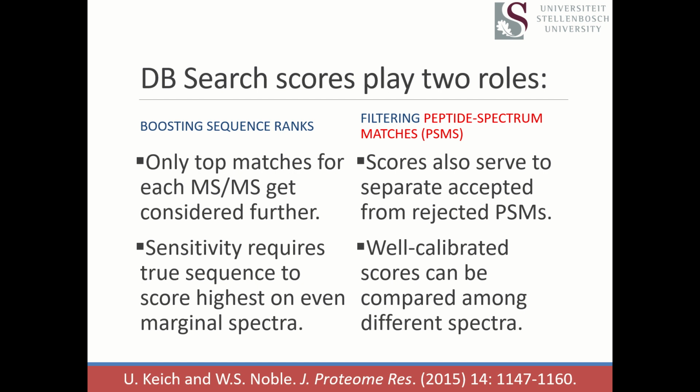All right, so let's talk about that second role, though. If you have well-calibrated scores, you can use these scores not just to decide which sequence is the best hit for a particular spectrum, but also to help you decide which spectra you trust the matches for.